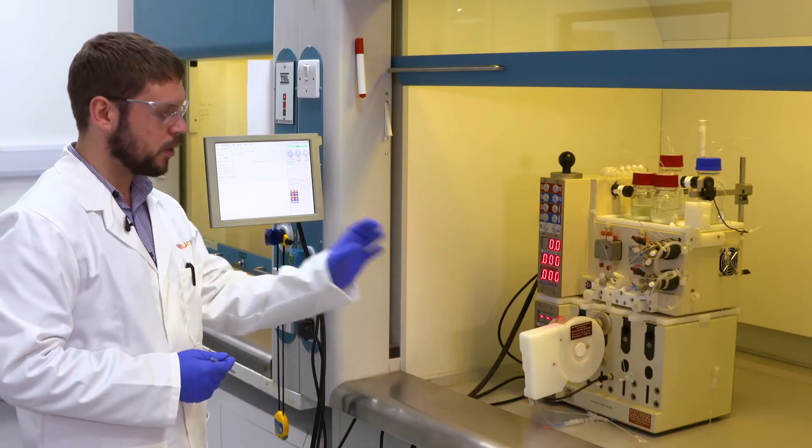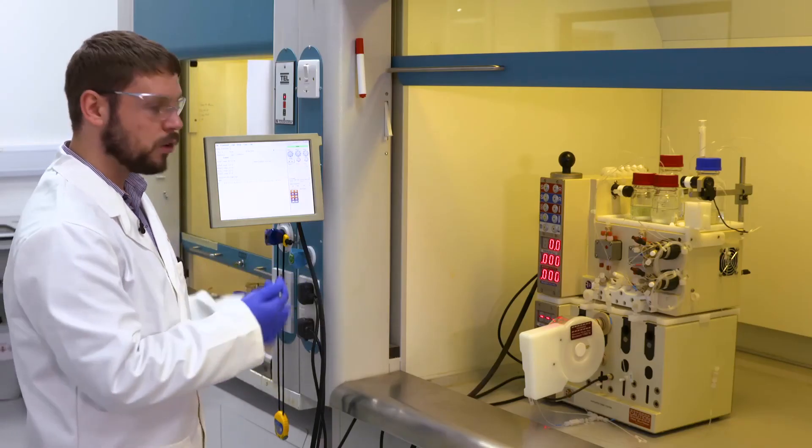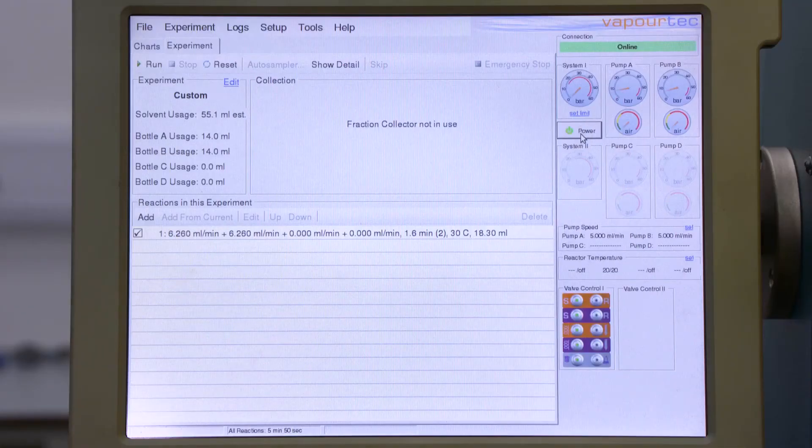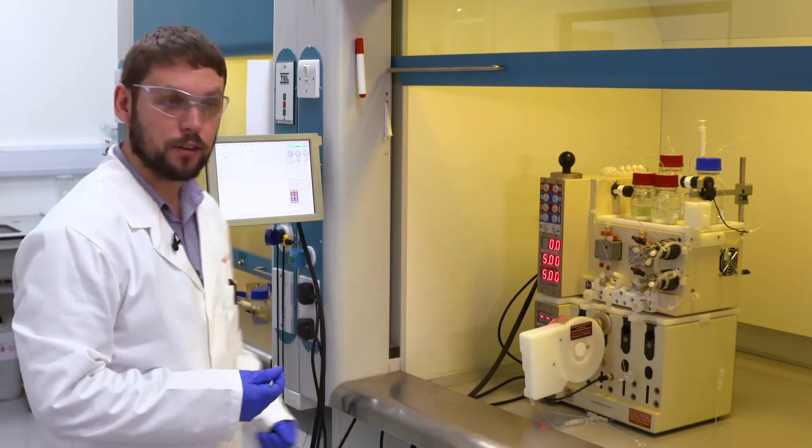Before I start the reaction, I need to make sure that the reactor is full of solvent, and I can control the pumps using FlowCommander. Now the reactor is full of solvent, I can start the reaction.